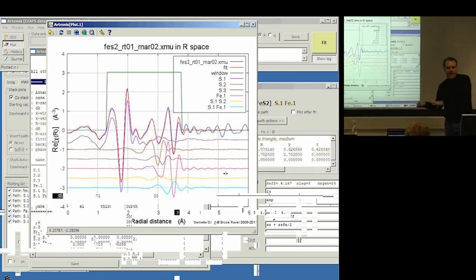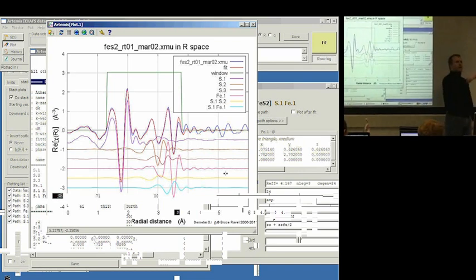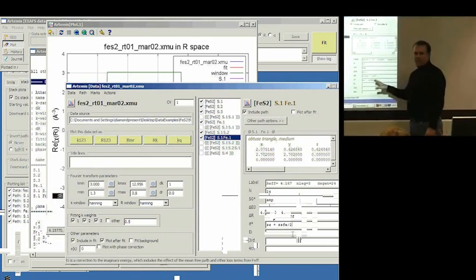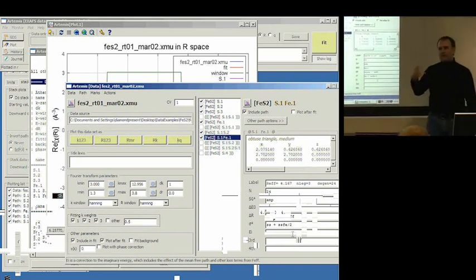And the part I'm going to assert but not demonstrate right now is that it's better to approximate their sigma squares in terms of parameters that you already have in the fit by using math expressions than it is to make up entirely new parameters. And that's easily tested. You could just, for this path, erase this, make a new parameter, define it up in the parameters page, and run the fit and see what happens. You'll get values out. You'll get statistical analysis that lets you compare the fits. And in general, you'll find that adding new parameters for these triangular multiple scattering paths is a worse idea than approximating their values on the basis of things you already have in the fit. But I'm going to leave that as an exercise for you.